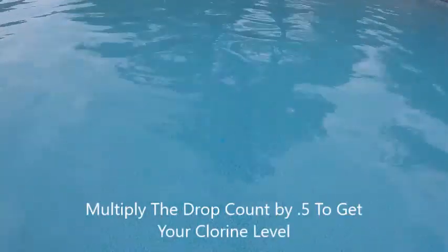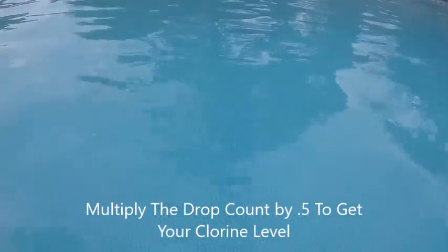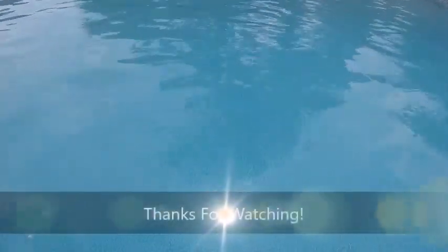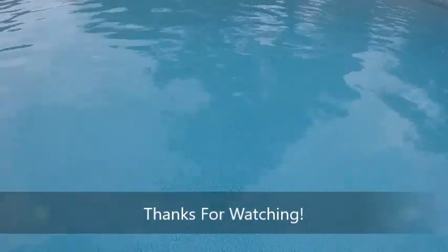What you would do is simply go ahead and multiply that by .5. So 6 times .5 means the chlorine would be at 3.0. 7 times .5 would mean it would be at 3.5. That means the chlorine is right at 3 to 3.5 for this pool. And that's how you would check an accurate test of your chlorine using DPD powder — it's a real effective way rather than having to look at strips to get an exact reading to within 0.5.